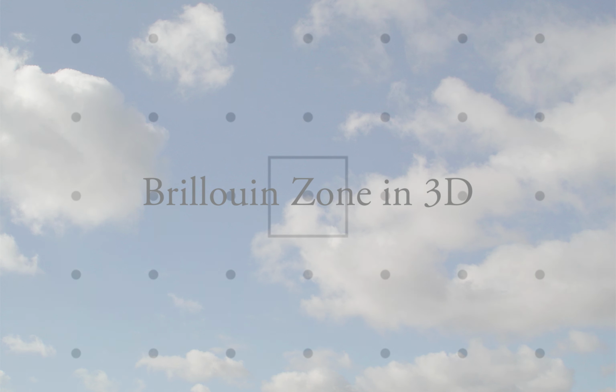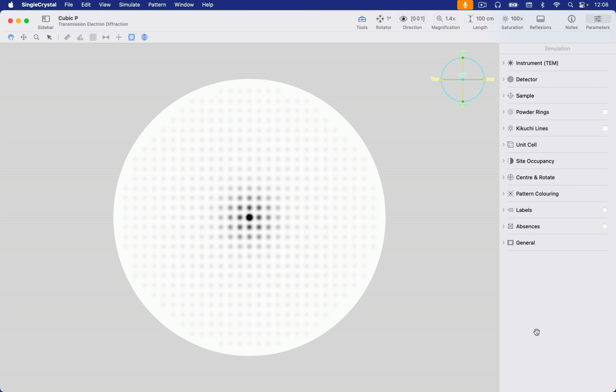Now let's extend this to 3 dimensions. We'll start with a simple cubic material with a primitive lattice and load its structure into SingleCrystal. Here we can see its default TEM diffraction pattern. We want to show the Brillouin zone around the centre of our pattern, and we want to show this in 3D.